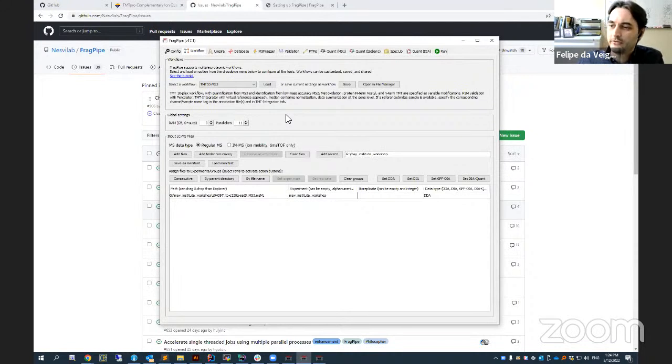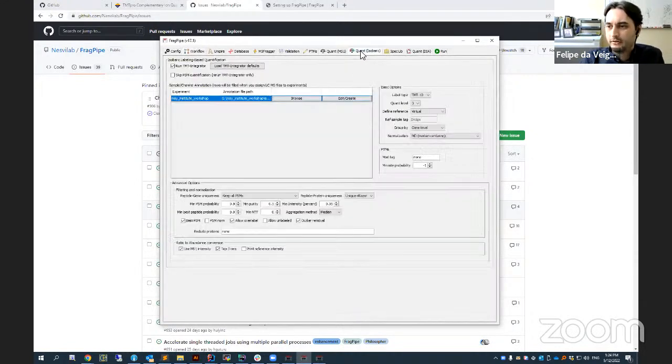Talk about normalization. Alex already mentioned a little bit about the process. It doesn't go much beyond that. Basically, we offer two methods. The most common one that we recommend for every process is median centering, which is a very standard approach.